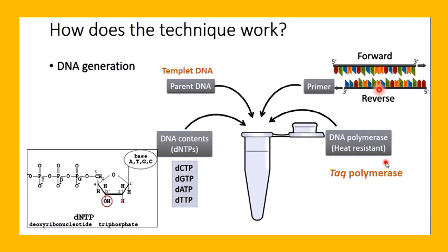These primers will attach, so they are designed to be complementary by base pairing between the primer and the strands of template DNA. From these primers, the elongation of DNA goes toward each other in opposite directions, as illustrated by these arrows.